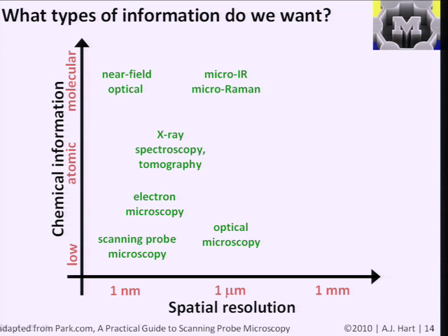And a lot of optical techniques, for example, simply excite the material with light that causes it to vibrate mechanically, and then use, say, scattered or emitted light to measure the frequency of that vibration, and are a very useful and practical and robust way to identify those bonding configurations. And if you know the vibration frequency of a certain bond, because you know its strength, it's like having a spring and two masses, and that is practically how a lot of that information is obtained, if you have enough molecules or of those bonds in your material to make it happen.